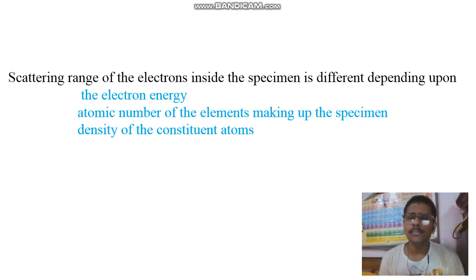Just to give you the information, SEM can magnify a particle to 300,000 times. Light microscopy can only magnify a particle to 2000 times, and transmission electron microscopy can do a huge amount, 3 million times magnification of a single point. So TEM and SEM are both very good for getting the intricate details of the specimen.